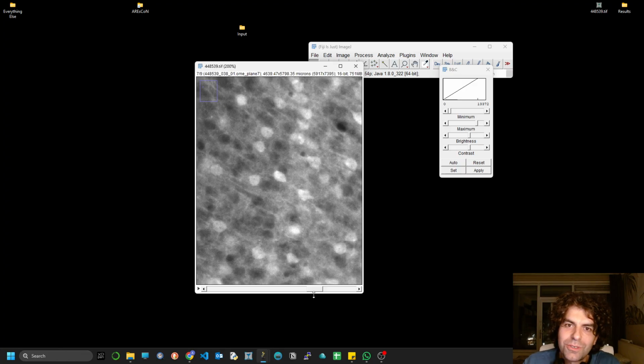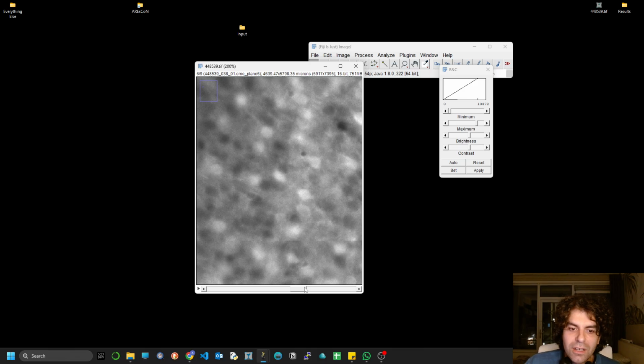But of course, when you start getting predictions, the first thing that you want is to capture as many true positives as possible. So at this stage, we want to capture a lot. We make the network sensitive, in a sense that it's sensitive to many different things that can be the real observations. And then there is a way to filter out these observations, right?